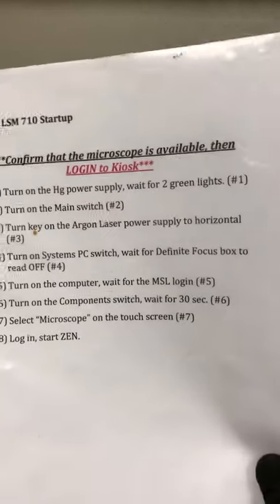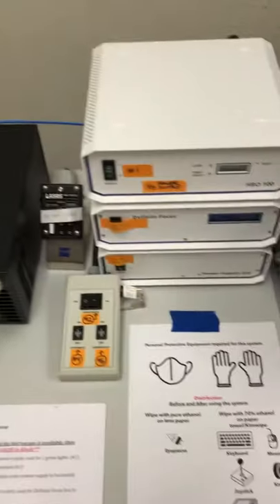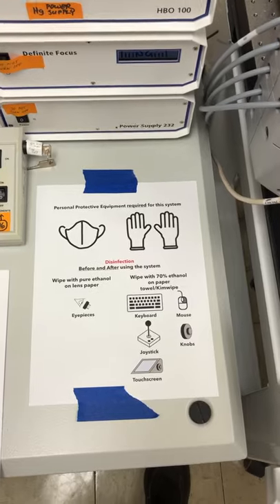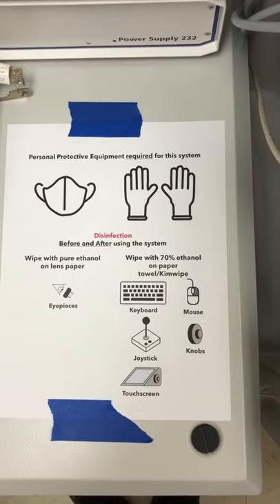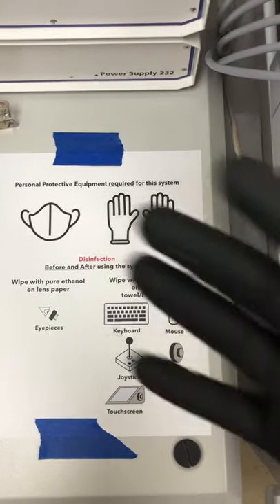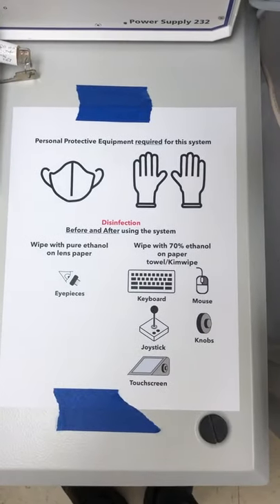We're going to go through these, but because these are COVID times, we have some additional things we need to make sure we're doing properly before we start with those startup instructions. These are personal protective equipment and disinfection. The personal protective equipment required for this system are gloves and a face mask — you can see we have both.